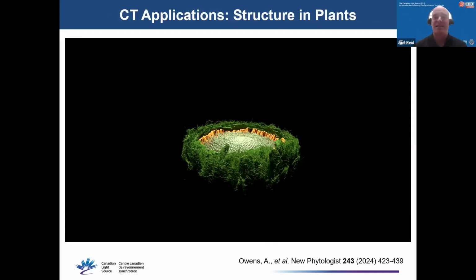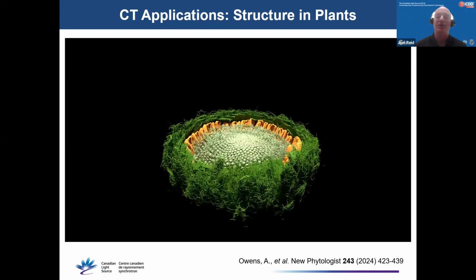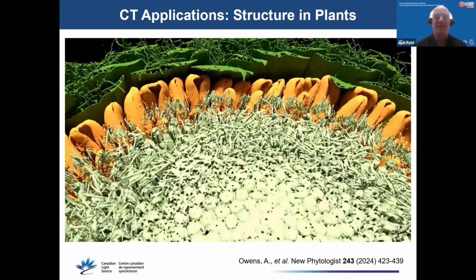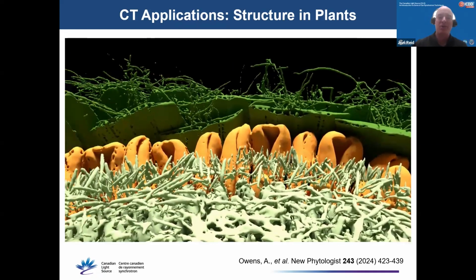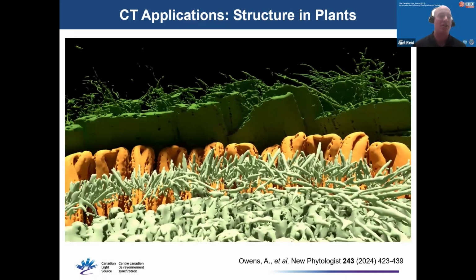This is the last example of the day. These researchers were studying differences in plant vascular systems in different members of the Asteraceae flowers, commonly known as the daisy family. This is a fly-through video looking at the head of a Gerber daisy and illustrating the internal structure of the plant, which was determined with computed tomography. I can't personally do justice to the various features of this plant with words, so I'm just going to let you watch from here.